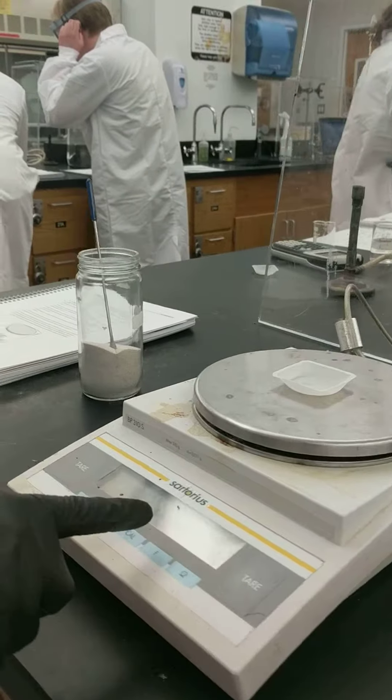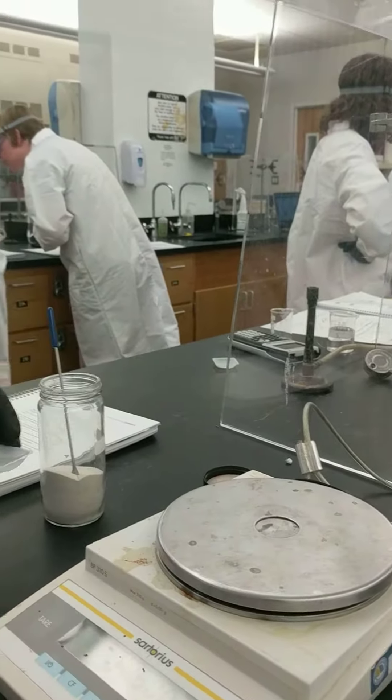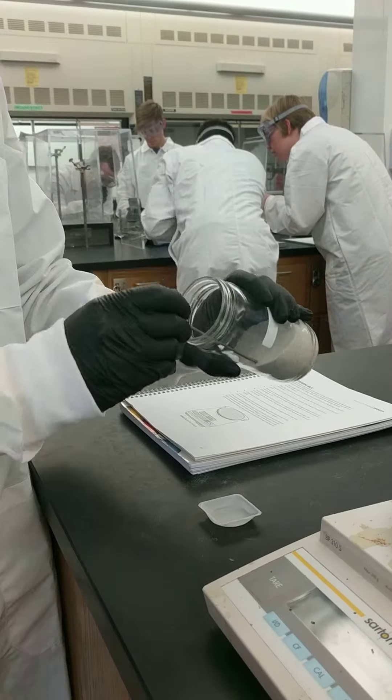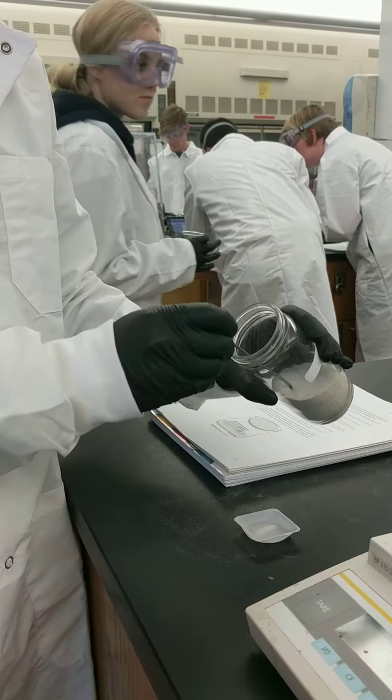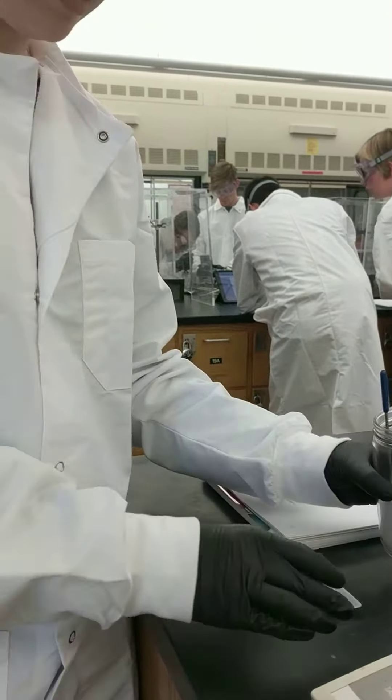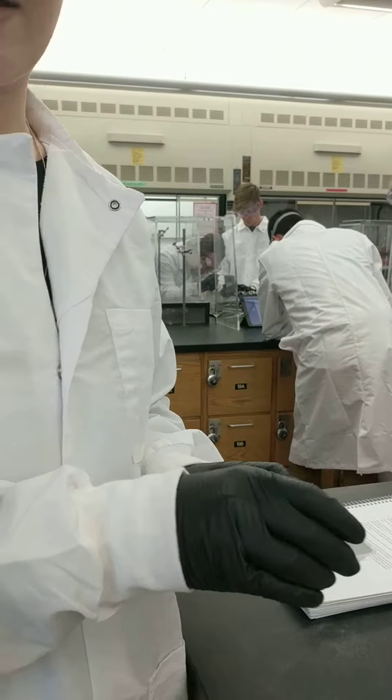And now it's at zero. When I want to measure the chemical, I take the weight boat off of the scale, and then I put some of the chemical onto the weight boat. Today, I'll be measuring this to 0.25 grams.